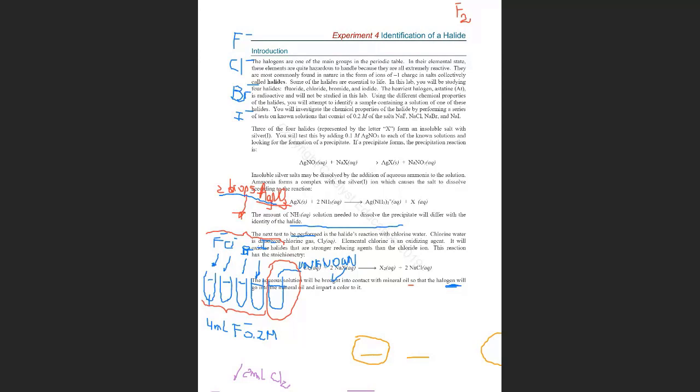If the chlorine water was reduced, the other halide has to be oxidized, right? Let's look at the halide here. It's a -1 to an elemental 0. So here it was oxidized. One is always reduced and the other is oxidized.